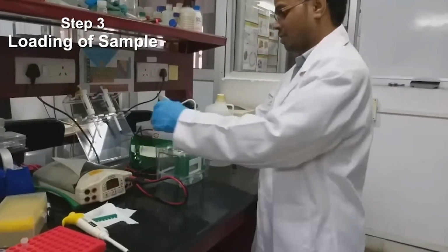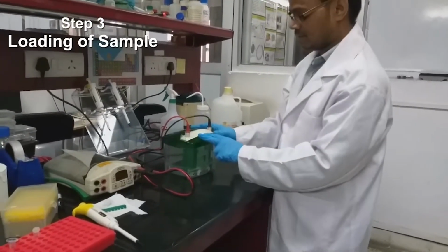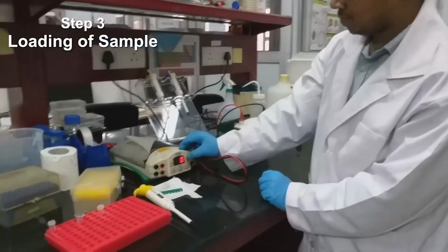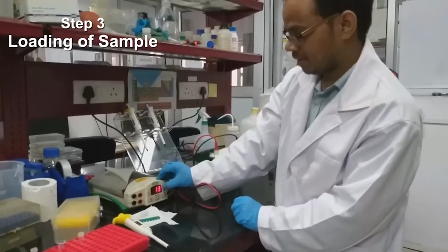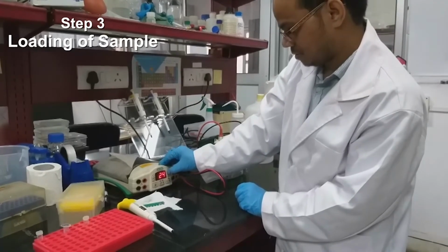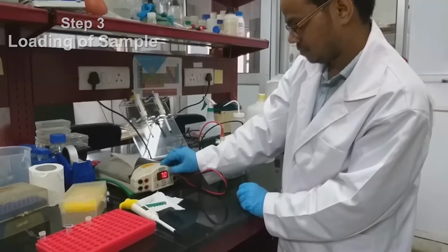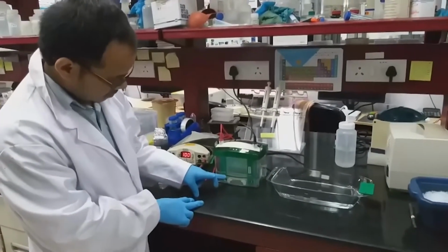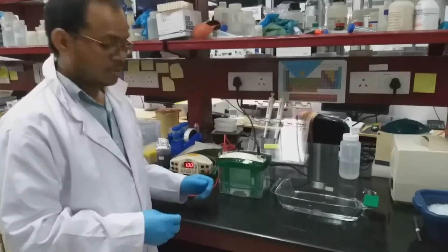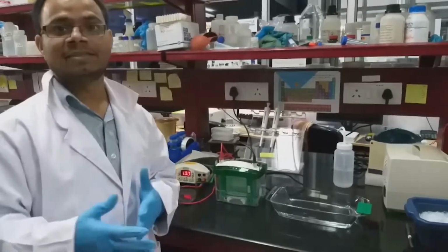Once the loading is over, we have to fix this gasket. I am going to set it at 70 volts. As we can see, it is almost over. So we can take out the gel, then we will stain and de-stain it.